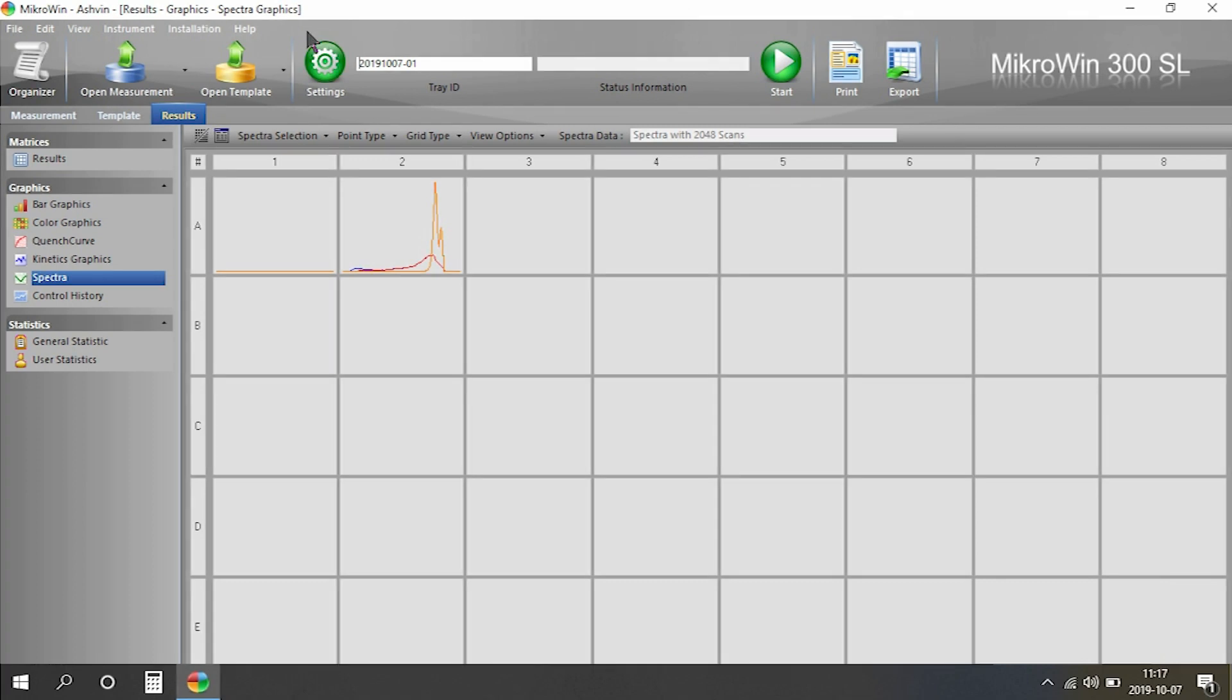Within the software, if we go to Result and then Spectra, we can see the spectrums for each individual sample.